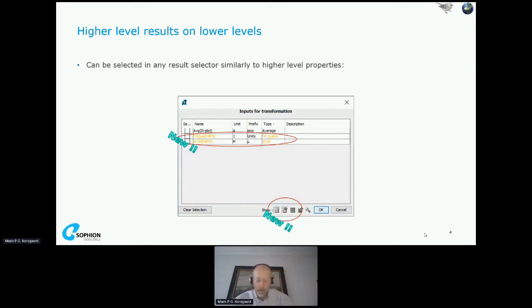When you go through the analysis steps, you have to go to higher and higher levels, and you didn't used to be able to go back. But now you can take any result from any level and make it available to any level. There is a risk of circular references, but that's now up to your own biological and scientific responsibility, because this we have decided to allow and to thereby open a lot of possibilities.